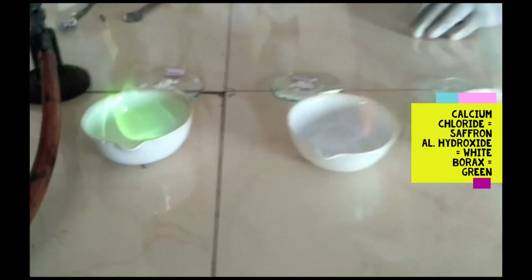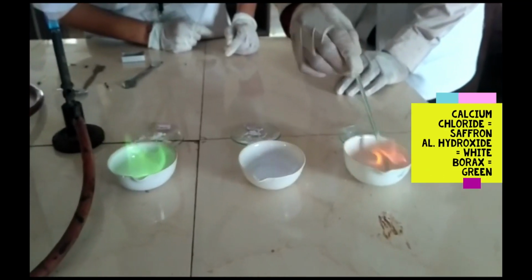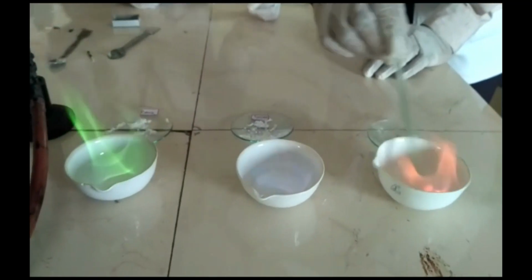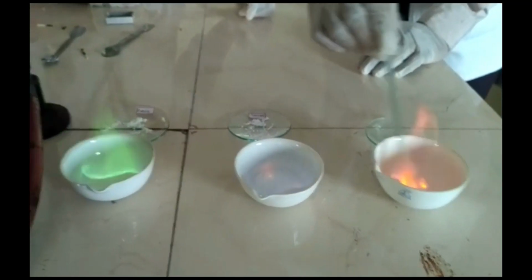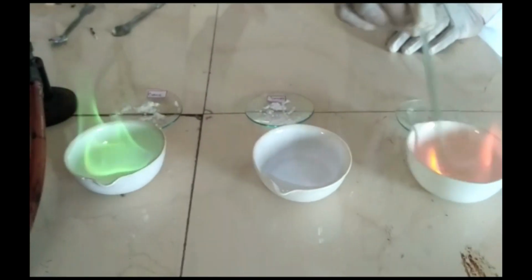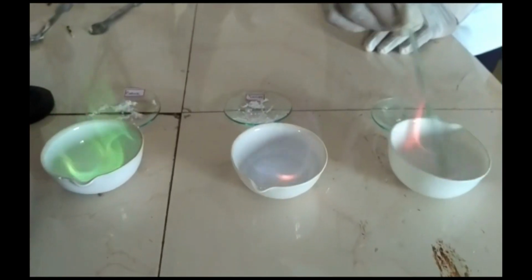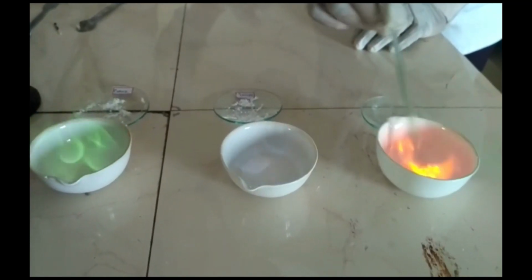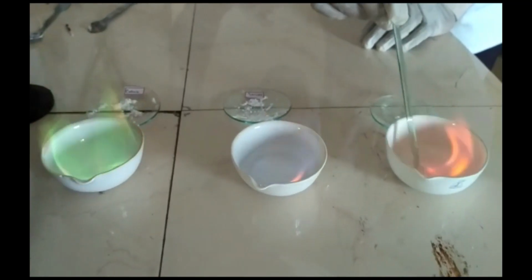The color that we can see represents the tricolor. The reason why it produces the color is because the electron present at the outermost orbital jumps to a higher orbital, and when it comes back to its outermost orbital, it emits color. So that is what is happening to the three china dishes.